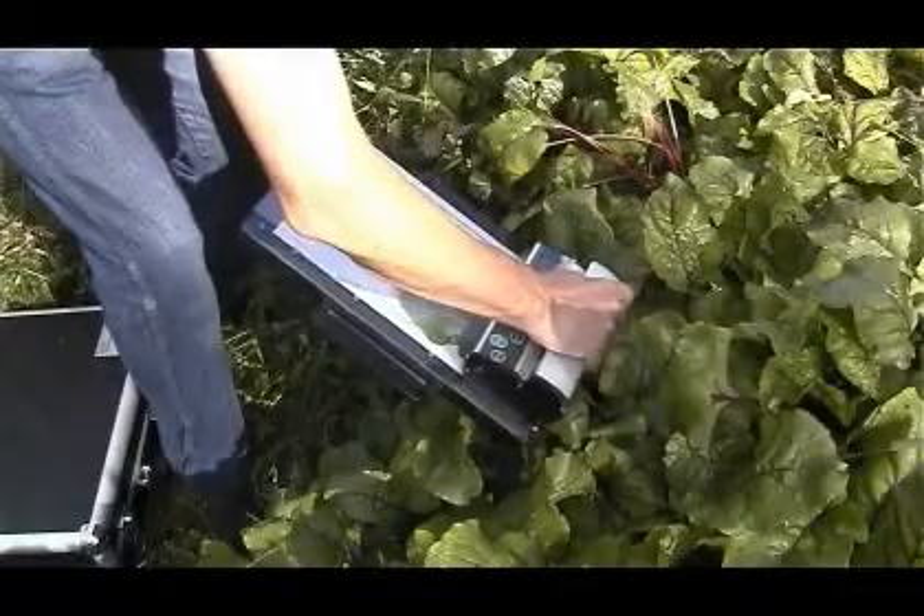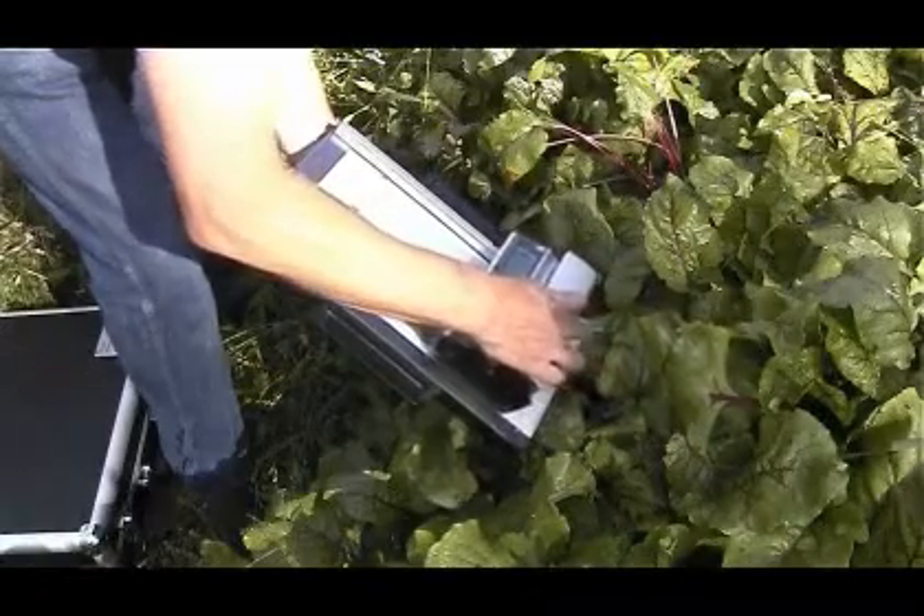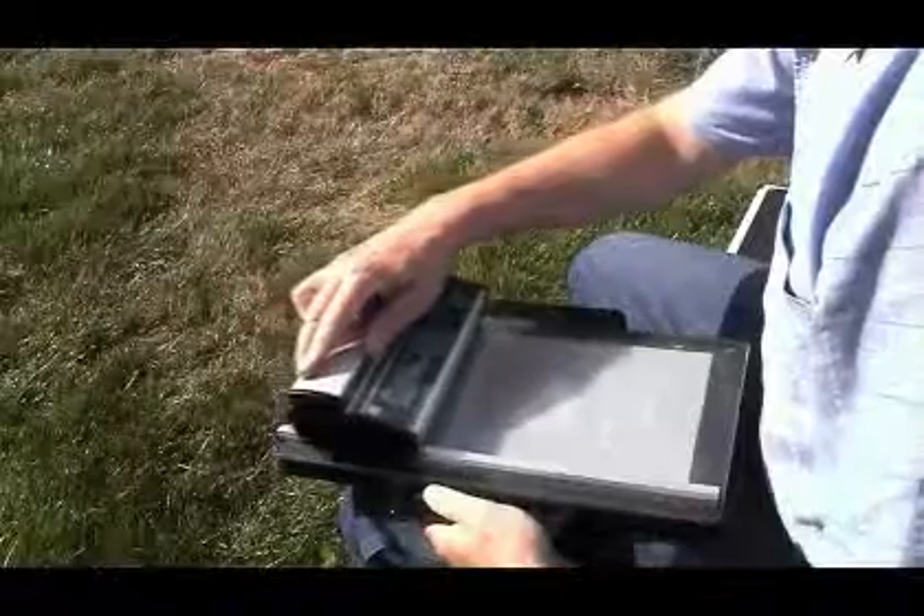After activating the device by pressing the start key, a low energy laser beam sweeps across the laser window 500 times per second at a rate of 150 meters per second.